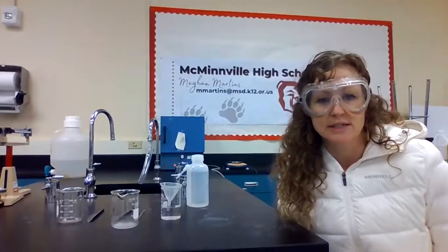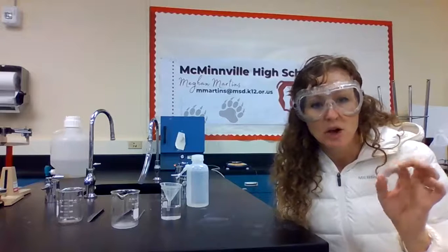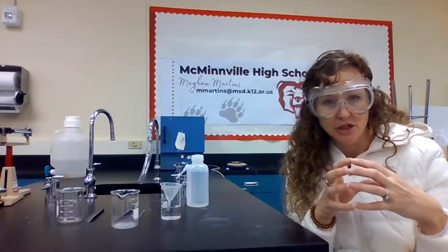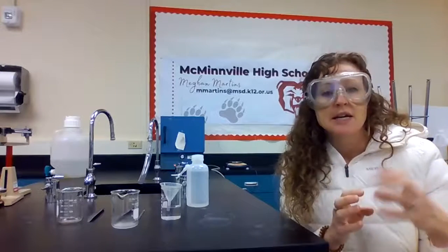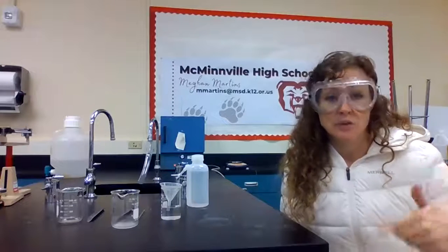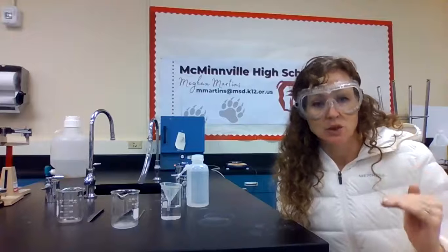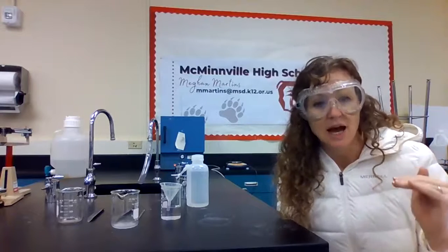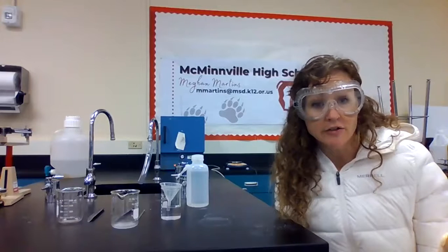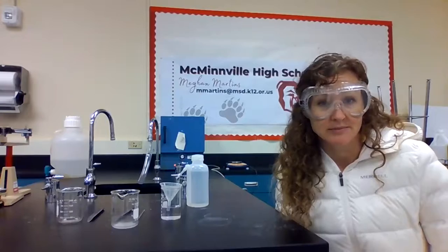So what we'll do is every 10 minutes we'll check it, and then we also want to break up any clumps, because clumps are going to tend to hide the moisture and it'll take longer to dry those out. So we'll check it, we'll break up any clumps, we'll weigh it, and then we'll keep doing that in 10-minute intervals until it stops losing mass. Once it stops losing mass, we know that we've driven all the water off, and then that can be our final mass of our sample.